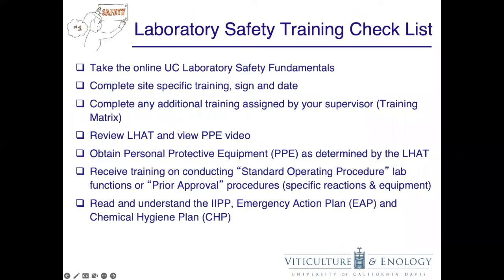Because working in the laboratory presents many various hazards, safety training must be completed prior to beginning any work in the lab. Personnel working in laboratories must complete the online UC Laboratory Safety Fundamentals, complete the site-specific training, and complete any additional training as required by the lab which you will be working in. This additional training will be discussed later on.